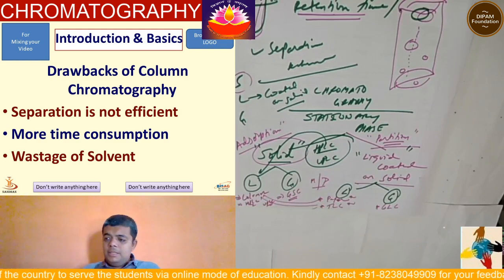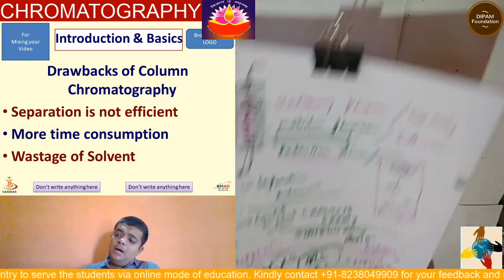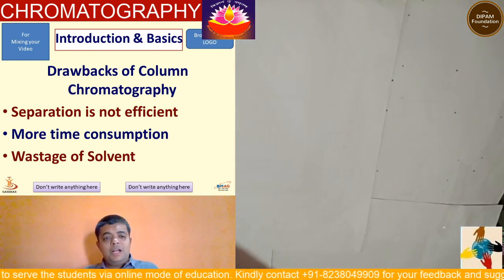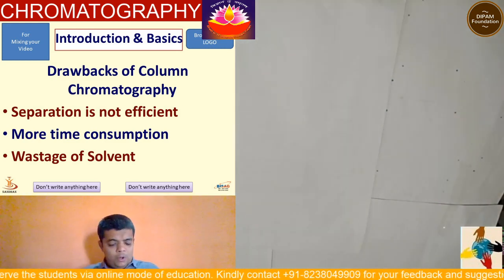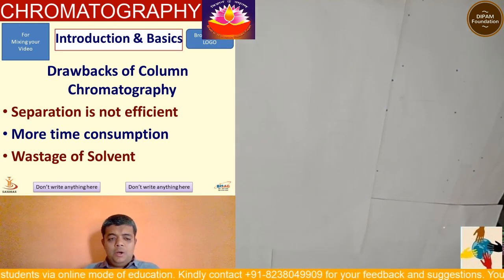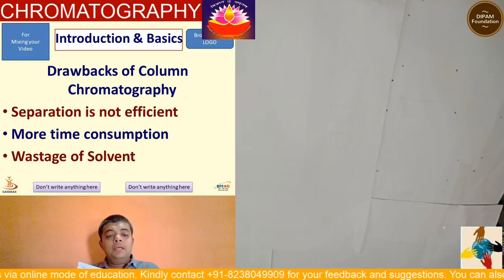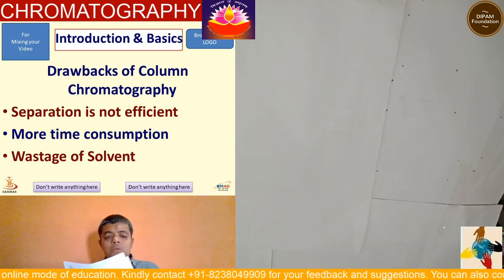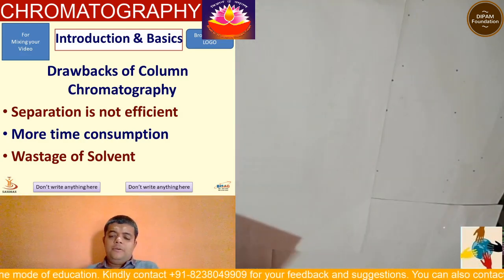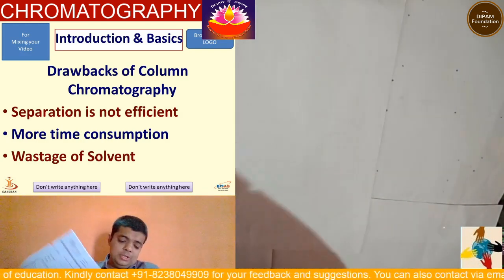Now, this was all about the basics of chromatography. We just saw a very precise explanation of the classification of chromatography. As you all know, HPLC was already made a few years before in the regional language.